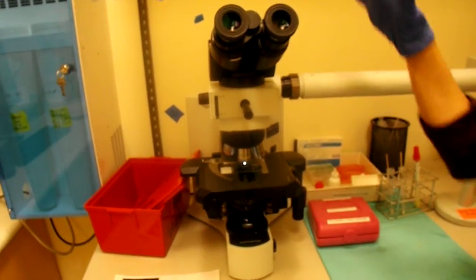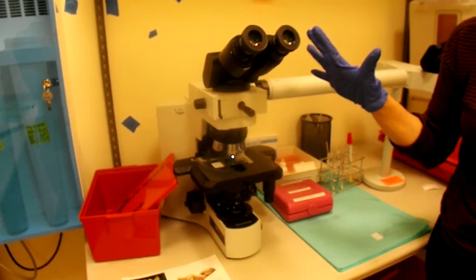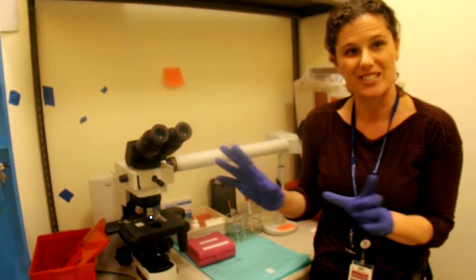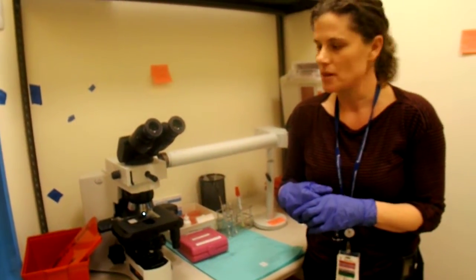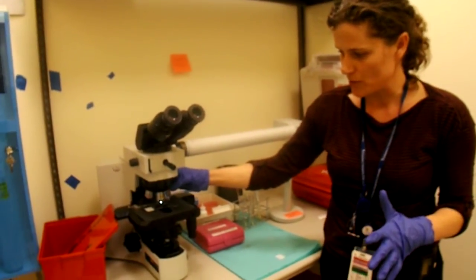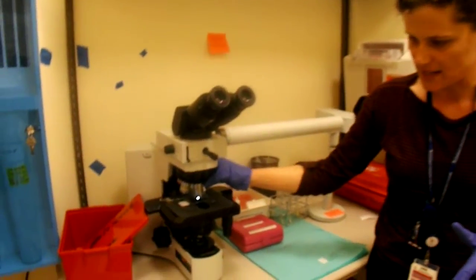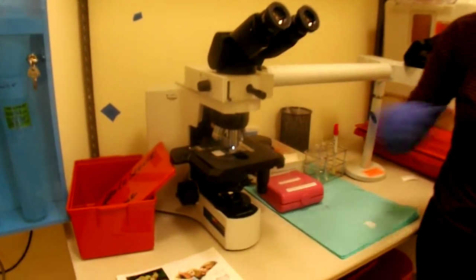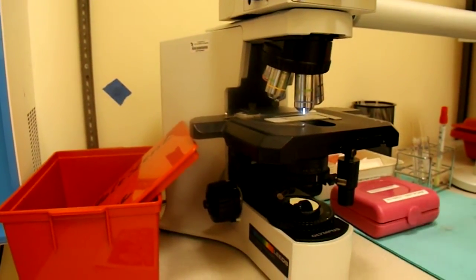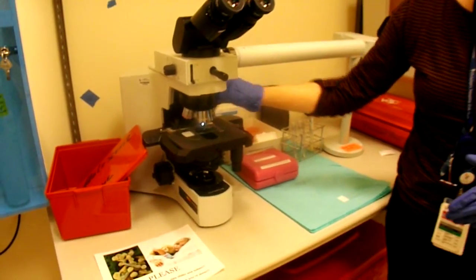Once you get a good vision of the cells from above, from a wide view, you're looking for anything moving like trichomonas, anything that looks kind of stick-like, like yeast, or a lot of white blood cells. Then you can usually move it to a higher level. Again, make sure it's not so high that the lens is going to hit the microscope. When you move it to the higher level, you should be able to see your cells better, to look for things like clue cells, trich, white cells, and yeast. So that is your saline slide.